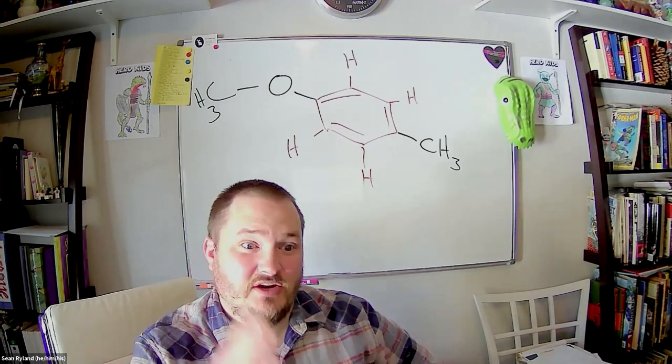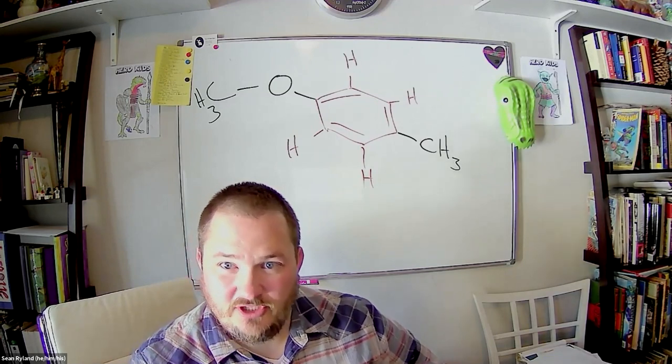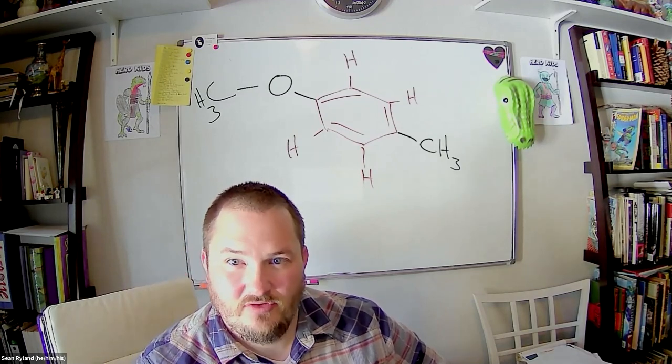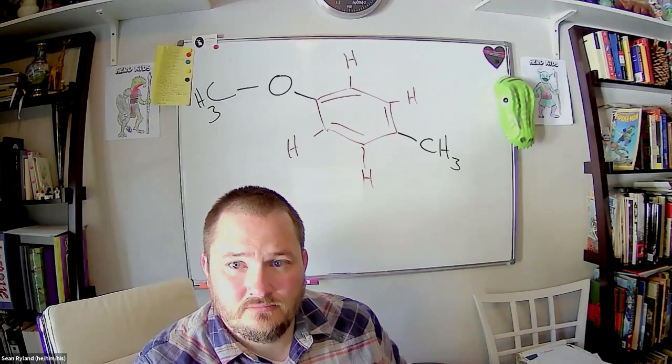We're just looking for, is there a signal there? And where is it on the chemical shift? That's really all we can interpret. It's not like IR, where we're looking at a strong, sharp peak versus a broad peak. That doesn't tell us anything in the NMR. Could we say, based off the location, it's closer to something electronegative or something like that? We can absolutely say that.